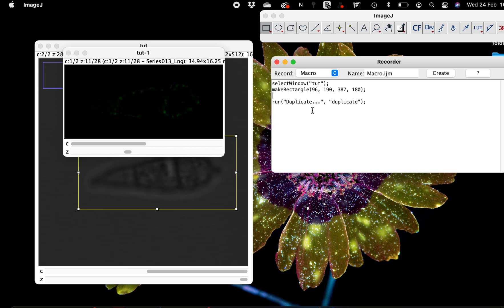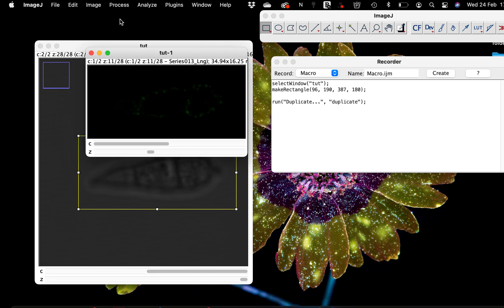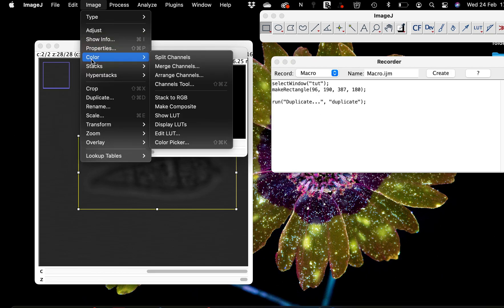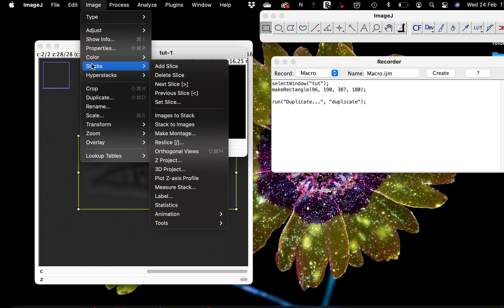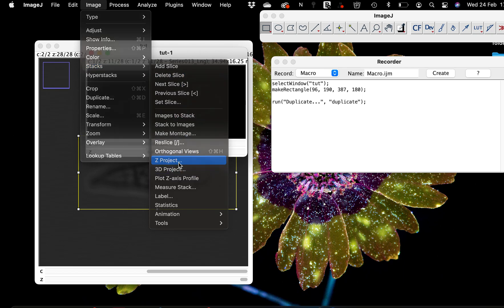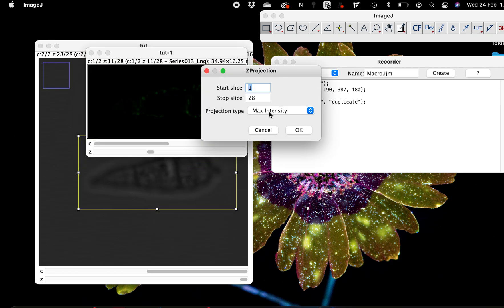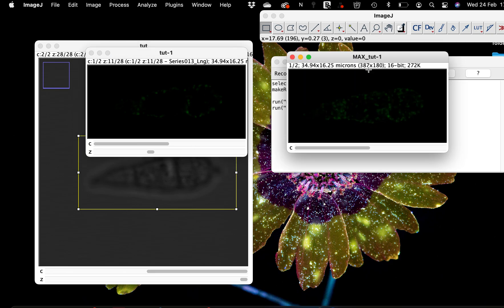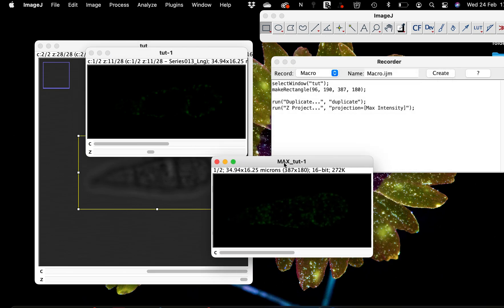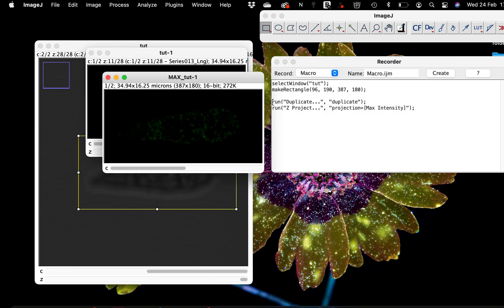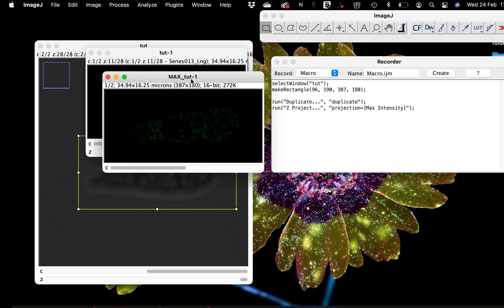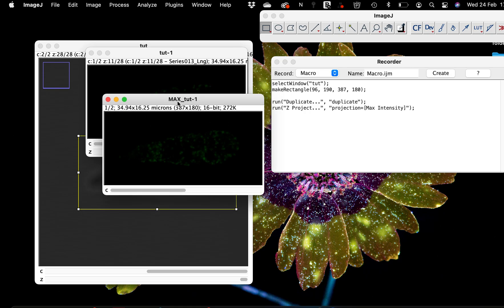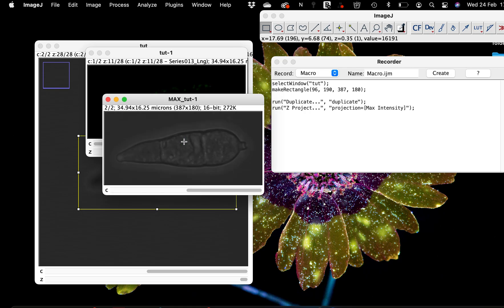Now that I want to make a Z-stack, I go to Image, Stacks, Z Project and make a maximum projection. Look at that, the command of what I just, or the long clicking I did has been written into a single line command.